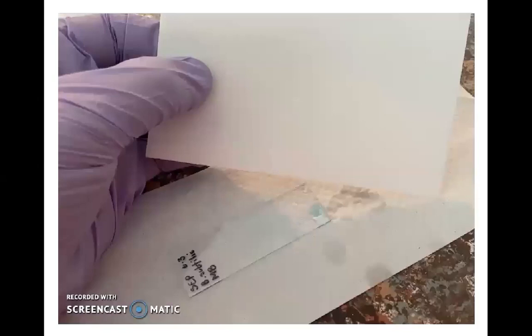You can allow the slide to just air dry, but you can also use this material here, which is called Bibulous paper. This paper is a thick, absorbent piece of paper, and it comes in pads.